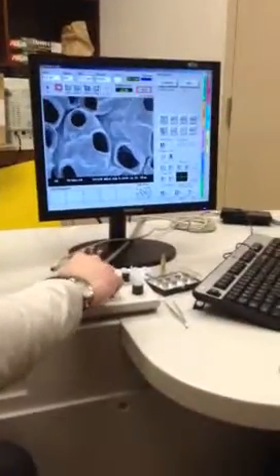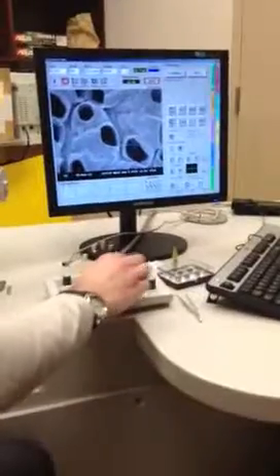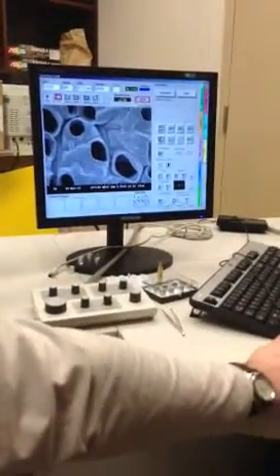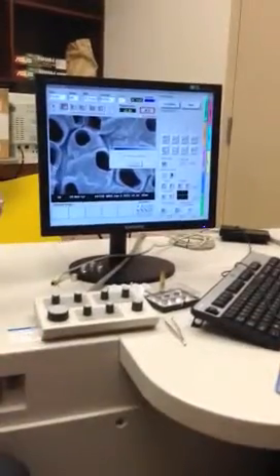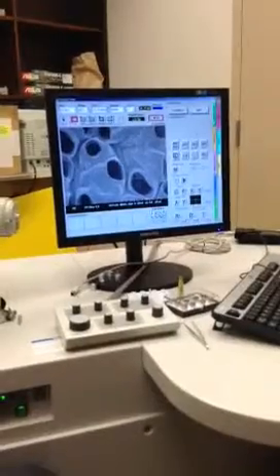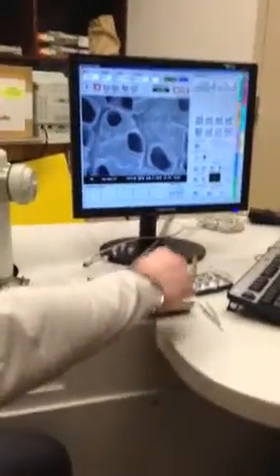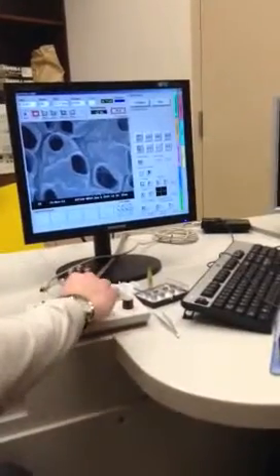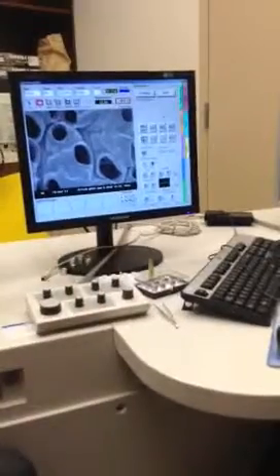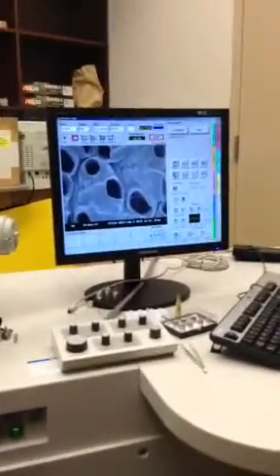So you can play around with these brightness and contrast knobs here to get it looking the way that you want, or again you can also hit this auto brightness contrast button. It usually does a pretty reasonable job, but sometimes you might look at it and go, that's not quite right. Fine tune it a little bit with contrast and brightness. The pore? So cool.